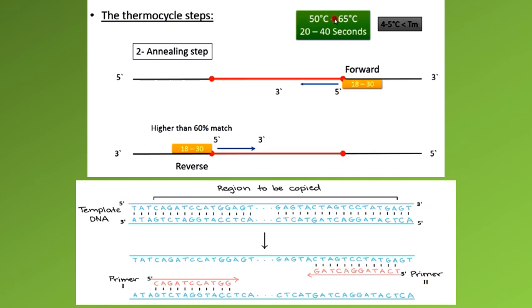For example, when you need to use a primer and you don't have the annealing temperature for this bioreaction, you must first calculate the Tm of such primers, and in turn you use the primer at an annealing point 5 degrees lower.